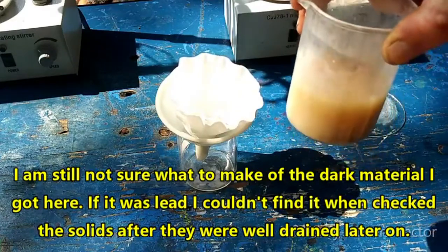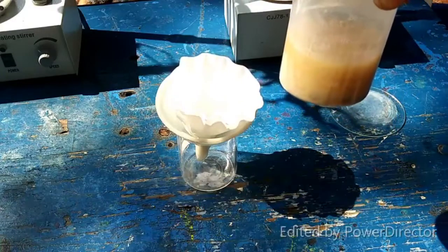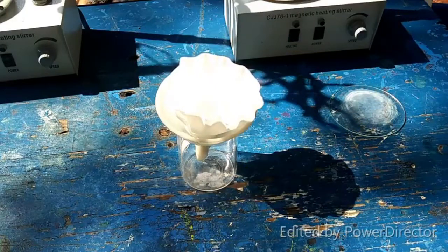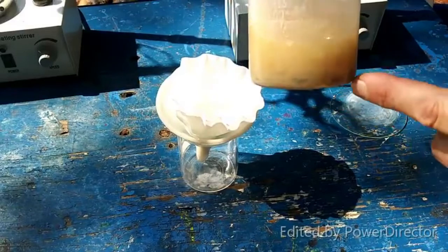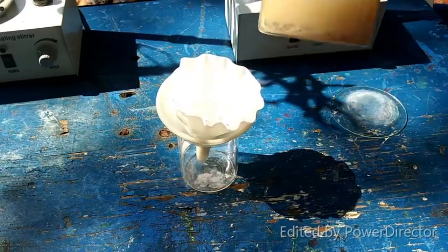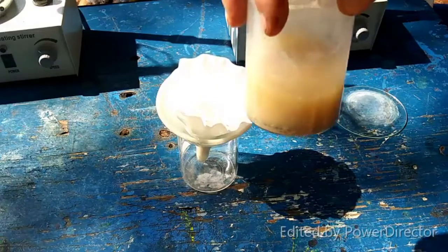We may end up with a crappy yield here, but we are going to soldier on. There's only a little bit of lead left — it's all along the edge here, like a powder, but there's very little on the bottom of the beaker.